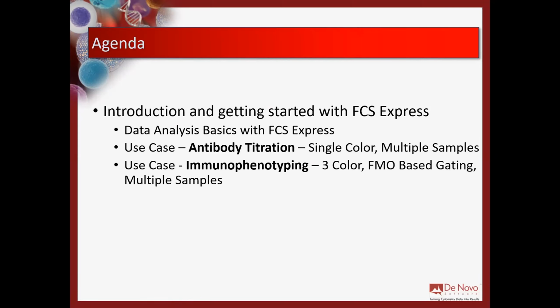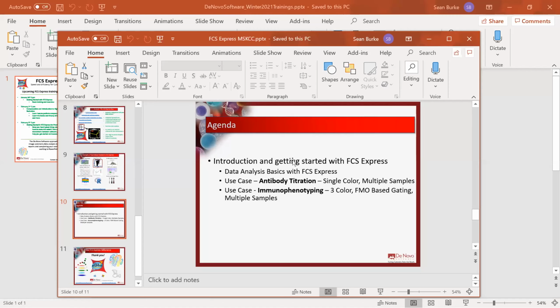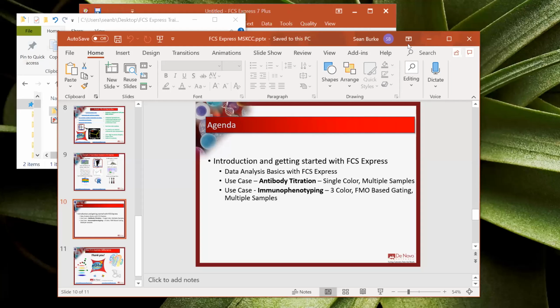If you have lots of samples that you're working with, this is the second workflow, where we utilize what's called batch processing. We utilize the data lists in FCS Express. So again, they're just two different workflows. Don't focus so much on the data itself. The data is actually unimportant for once in your life. You can focus on the practicalities of inserting plots, creating gates, and getting going with an analysis. So with that being said, I'm going to jump over to FCS Express here.